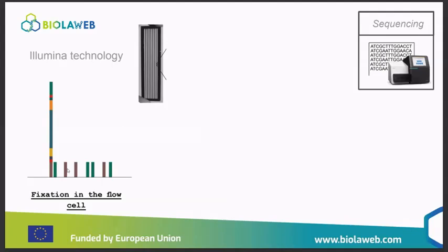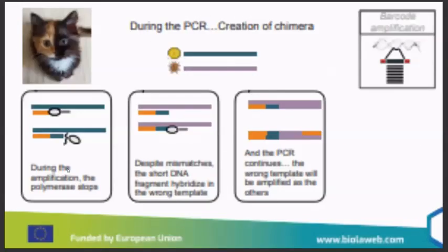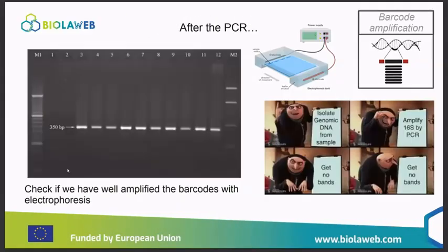And one more question: what is the difference between positive and negative controls? It's an interesting question. Negative controls are used to check if you have, for instance, DNA in your reagents for DNA extraction. It's to check that everything you want to be free of DNA is free of DNA.